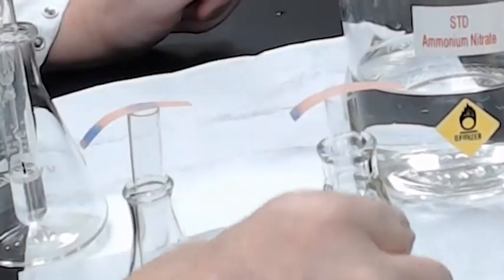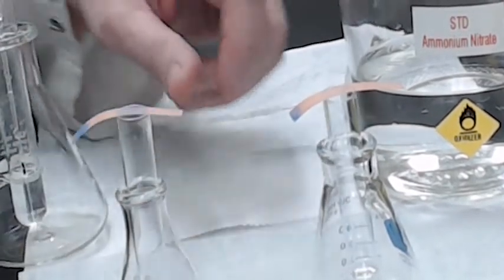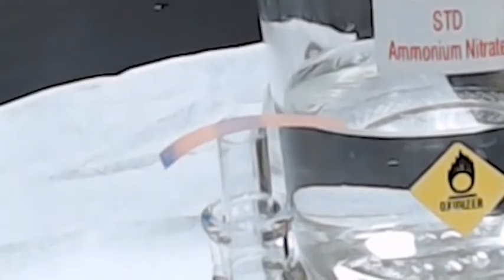the ammonia vapors, the smell, will reach the water, turn into ammonium hydroxide, and the litmus paper will turn a bluish color. And I don't know if you can see that. On the left one. This one is the unknown. We'll zoom in, but you can already see that that circle's turning bluish. So, and this is the known, and it's beginning to turn blue inside of the circle there as well. Let's move this out of the way so we have a nice white background. Okay.